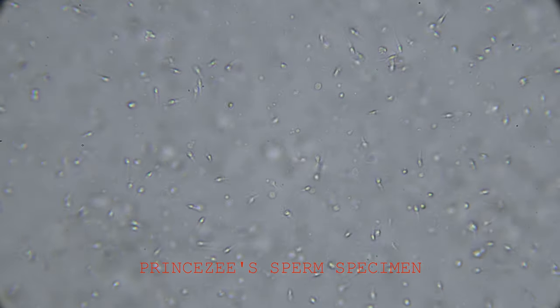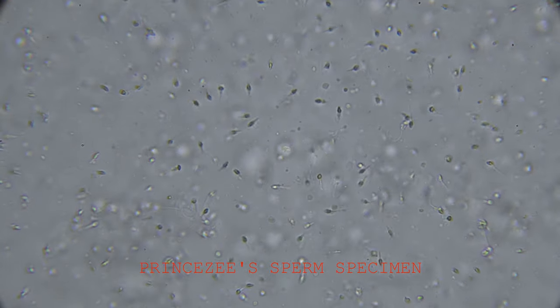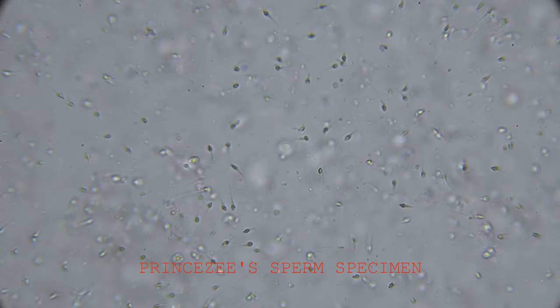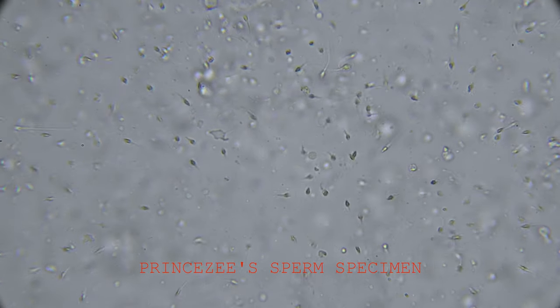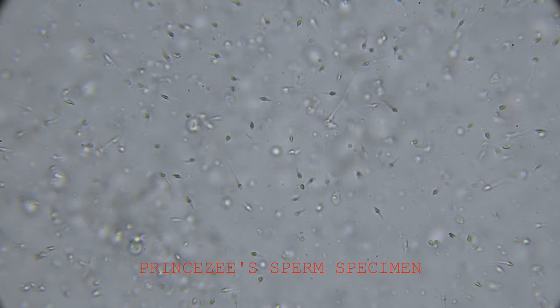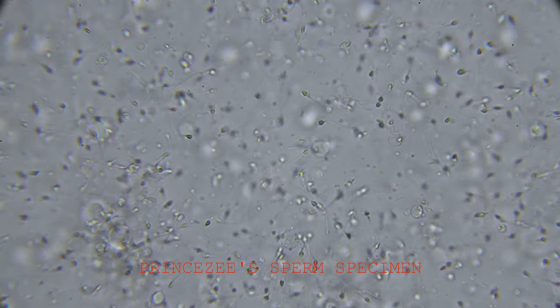Let me adjust the magnification. I don't know if this is a clear shot. Okay, it's a little darker now. You see, for the sake of your science, for the sake of your education, I sacrifice my nut for you guys. You can see like a whole bunch of sperms fighting each other now. Look at that, you can see like a whole group of five ganged up on one sperm.